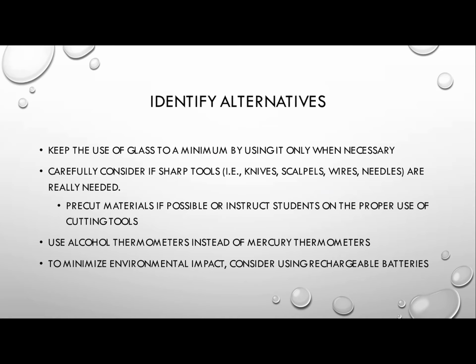Carefully consider if sharp tools, whether these are knives, scalpels, wires, and needles, are really needed. If possible, maybe you can pre-cut materials or instruct students on the proper use of cutting tools, but if you can avoid them altogether, that's really the best practice in the classroom.